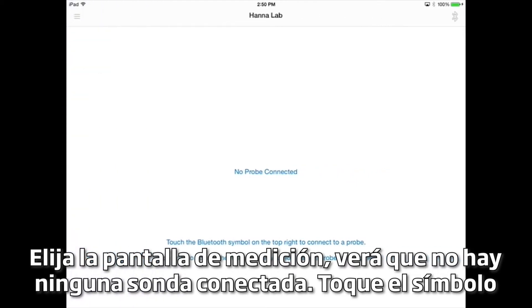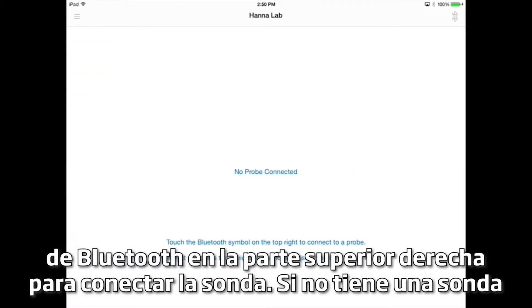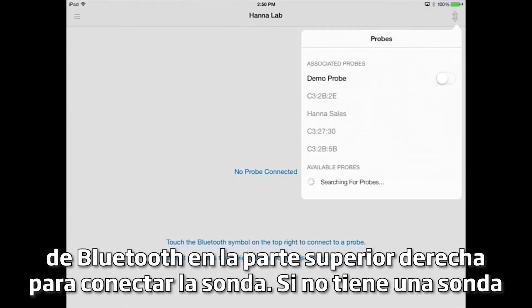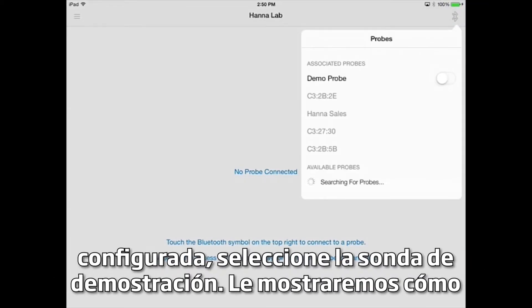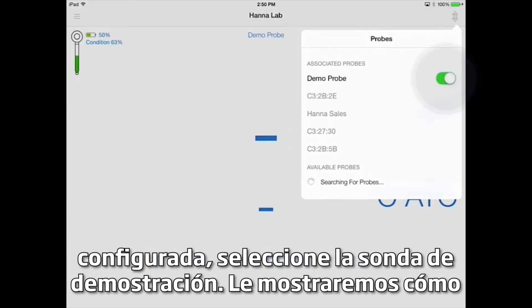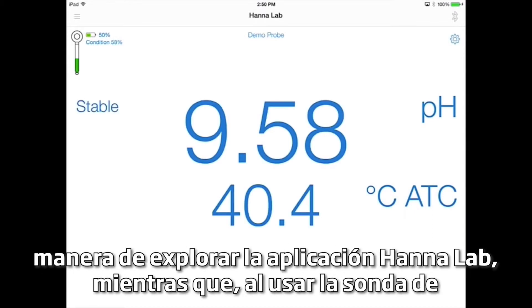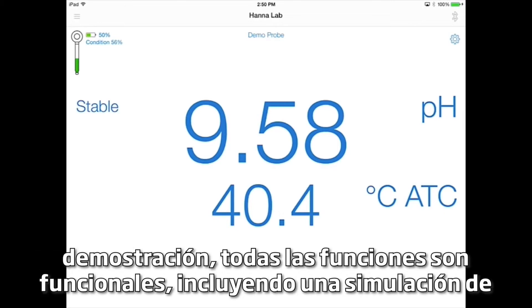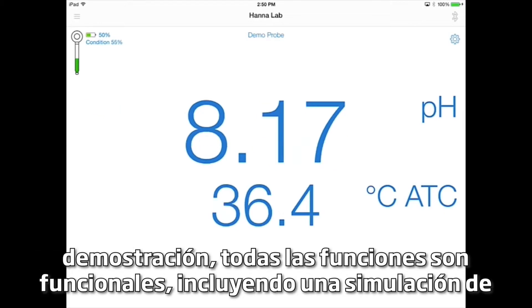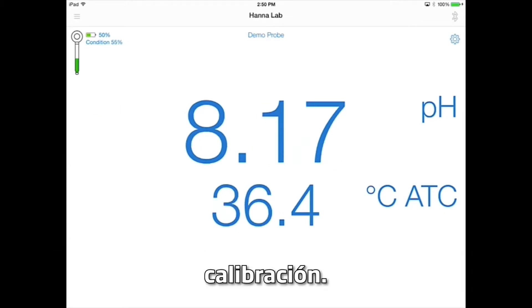You'll see there is no probe connected. Touch the Bluetooth symbol on the top right to connect the probe. If you don't have a probe set up, select the demo probe. The demo probe is a great way to explore the HANA Lab App — while using it, all features are functional, including a calibration simulation.